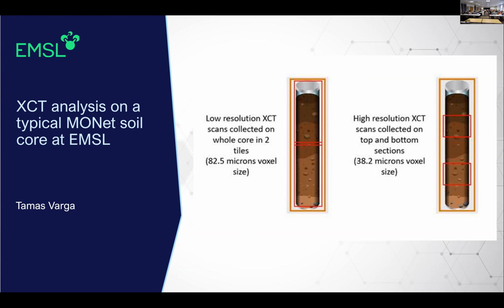That's an issue, and that relates to the question that came up about segmenting the roots as well. There is a lot of similarity, and so it depends on the system and how good data we are able to collect. Actually, we found it with one of our treatments. It was a drought treatment, and we did CT scanning of that. And the porosity was more than where we have precipitation.